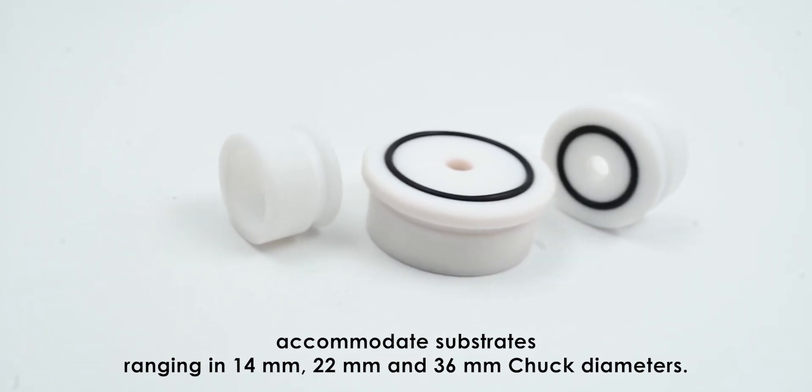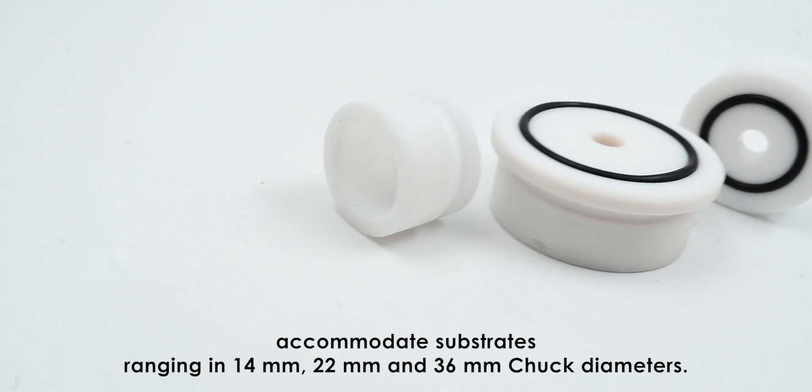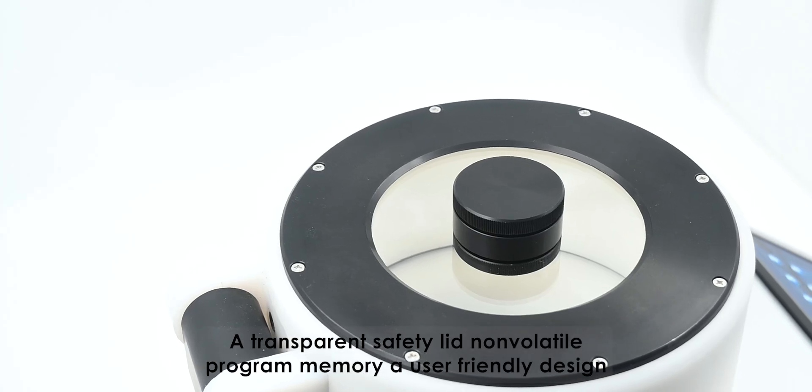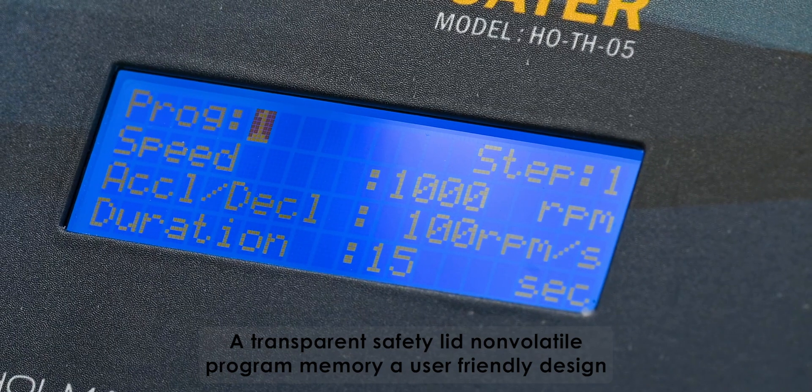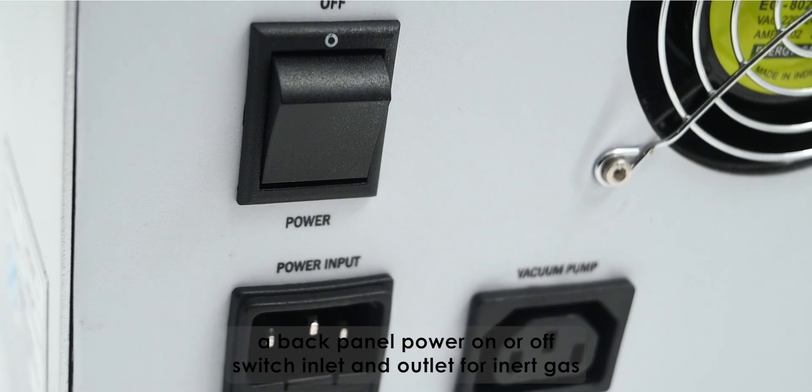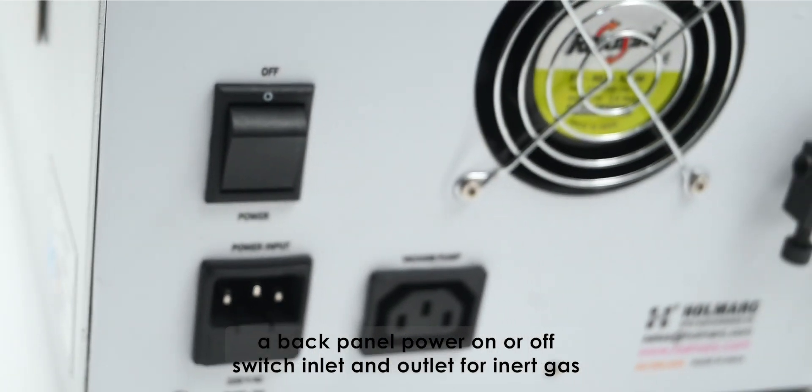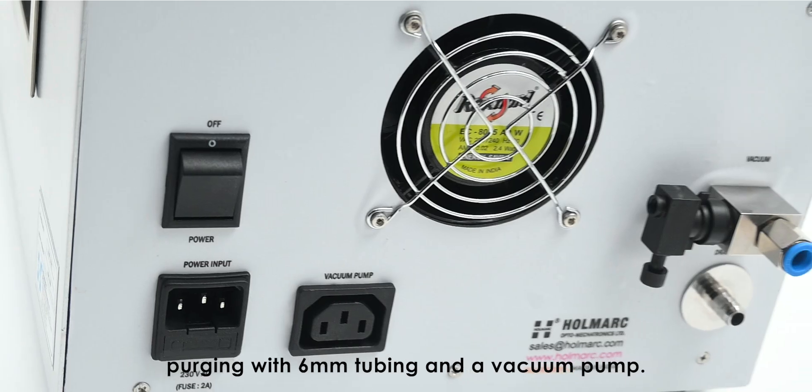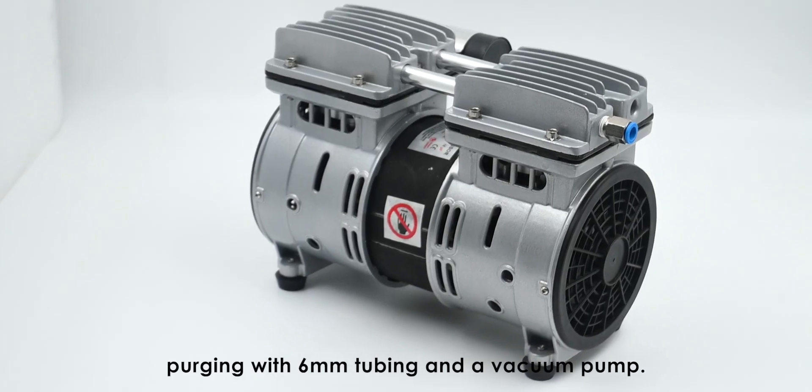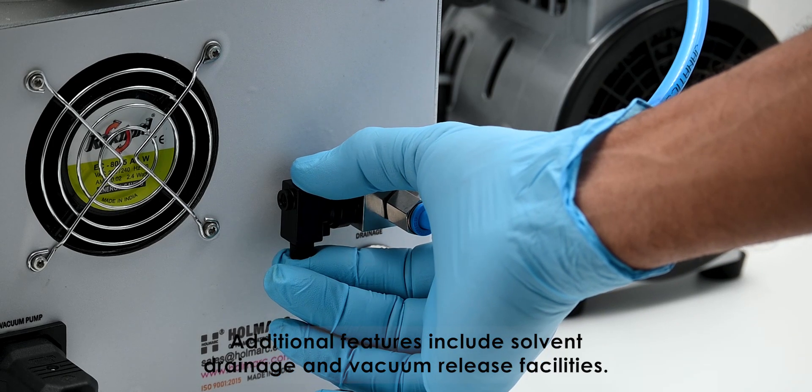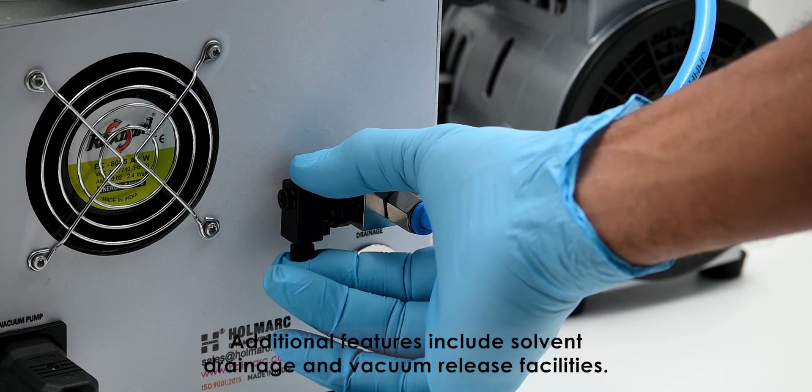Chuck diameters, a transparent safety lid, non-volatile program memory, a user-friendly design, a back panel power on/off switch, inlet and outlet for inert gas purging with six millimeter tubing and a vacuum pump. Additional features include solvent drainage and vacuum release facilities.